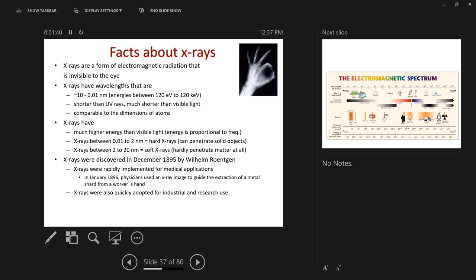Soft X-rays technically barely penetrate the material, which is a problem especially in geosciences, where for the most part 80% of space is occupied by rock or solid material. X-rays were discovered in 1895 by Röntgen, and the images, which are a projection that tells you the projected density contrast of a human body, have been common pretty much since. Alongside the medical use, they also started to be used for industrial and research purposes. But industry and research are interested in going into harder materials, and this is where we need X-rays with much higher energy.